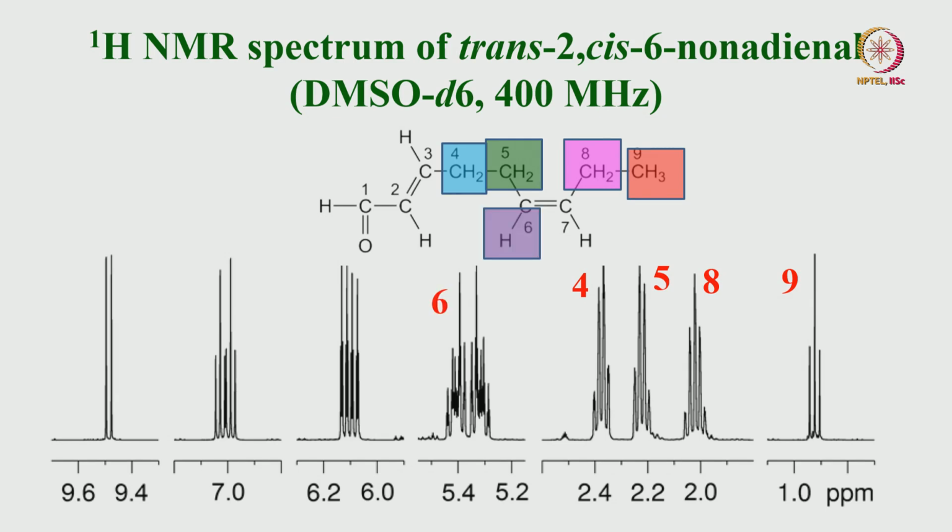So I would say that. And this is proton 6. Obviously, I told you it is complex. Similarly, this is 7, even that is also complex. Then what is left with you? What is left is this CH proton.